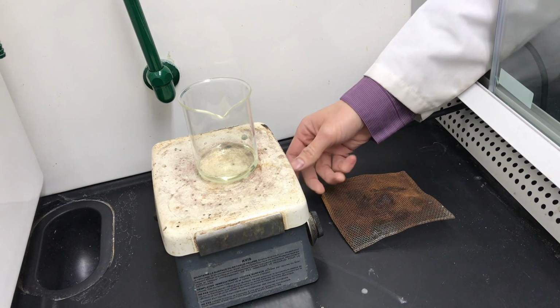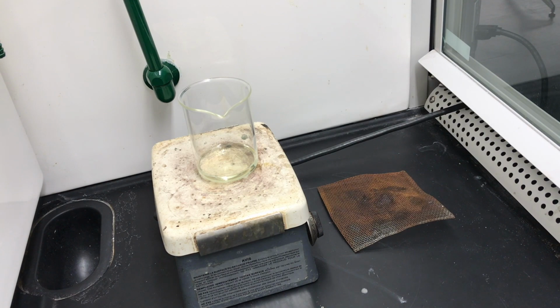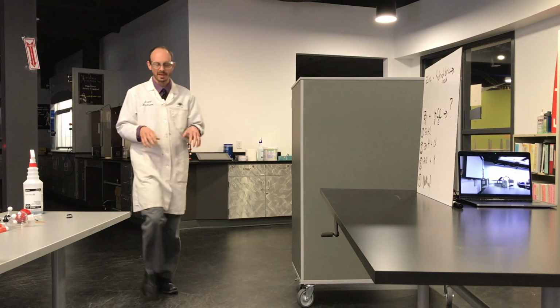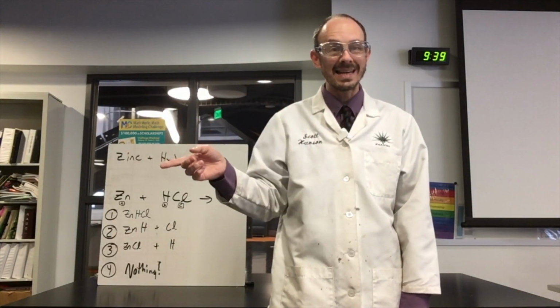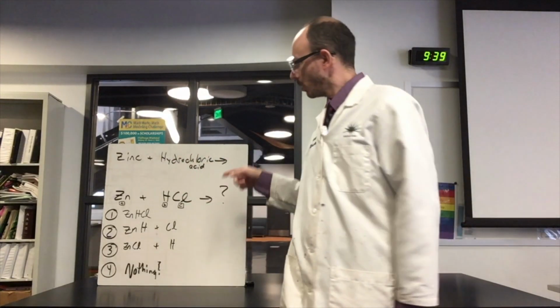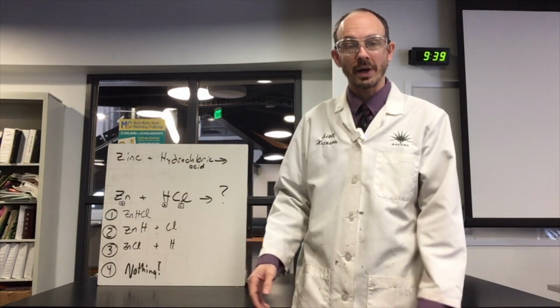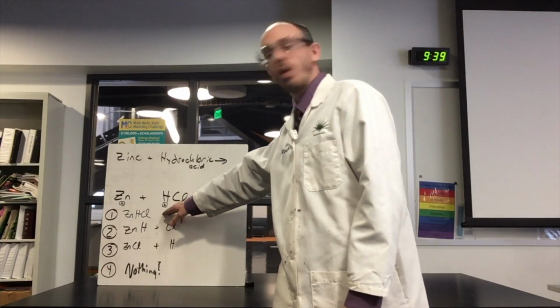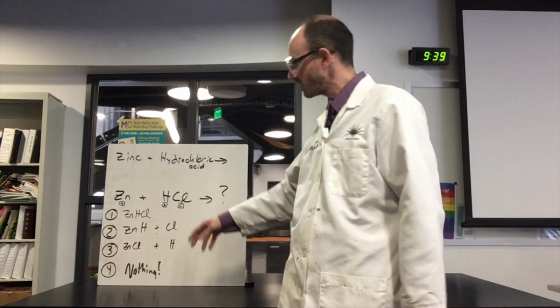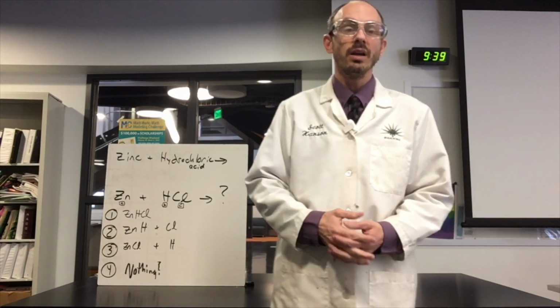But all of the zinc has now been eaten by the hydrochloric acid, I guess you could say. So that's heating, but there's a small issue. We know something happened, so we know it's 1, 2, or 3, but we also saw that gas bubble away. If it was 1, we don't see another thing that we could say that gas is. So right now we can say either that gas is chlorine or hydrogen.